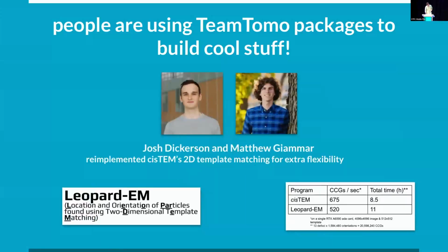The one that I'm particularly excited about at the minute is Josh Dickerson, who used to work close to me on the floor at the LMB, and Matthew, who's a grad student. They're both in Bronwyn Lucas's lab in Berkeley. They've re-implemented 2D high resolution template matching. The reason they wanted to do this is because if you want to run slightly custom routines, maybe you want to find your ribosome and then just search locally around the thing over here, this kind of thing, they would be able to tell you better exactly what they want to do with it.